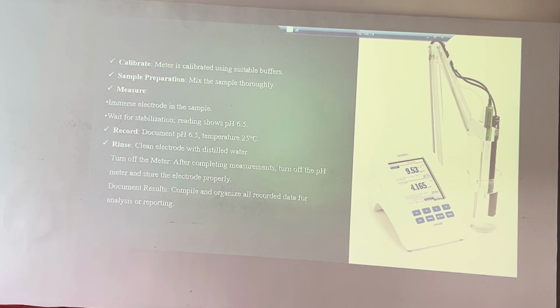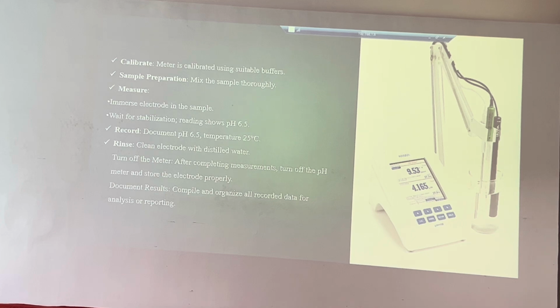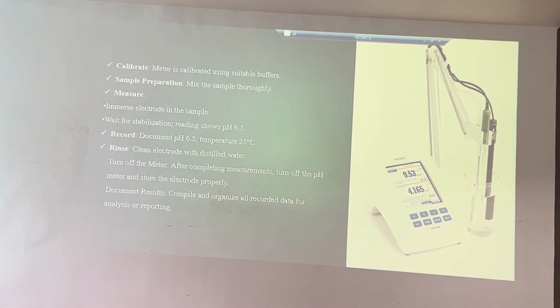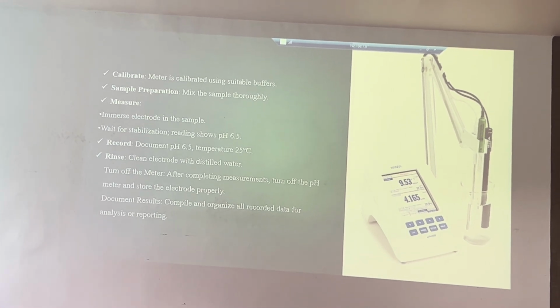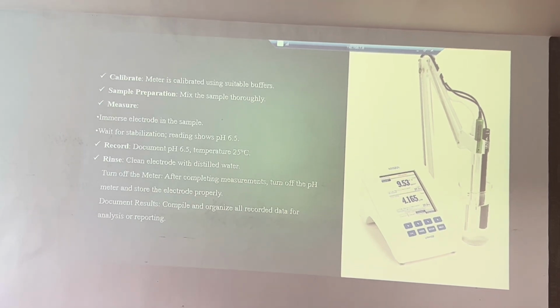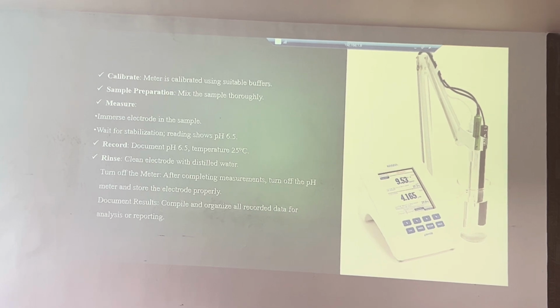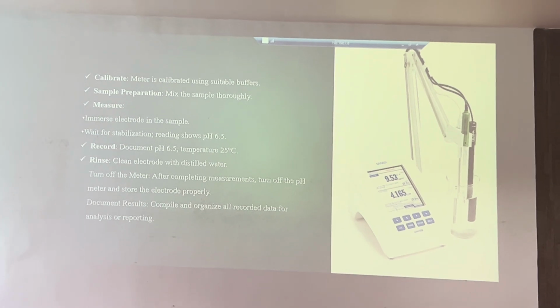So the pH meter: I don't need to tell much about it, but in the last 6 months, 3 times we got pH meter electrode breakage. Why is general practice more important? If you are not working properly, you always get into trouble.